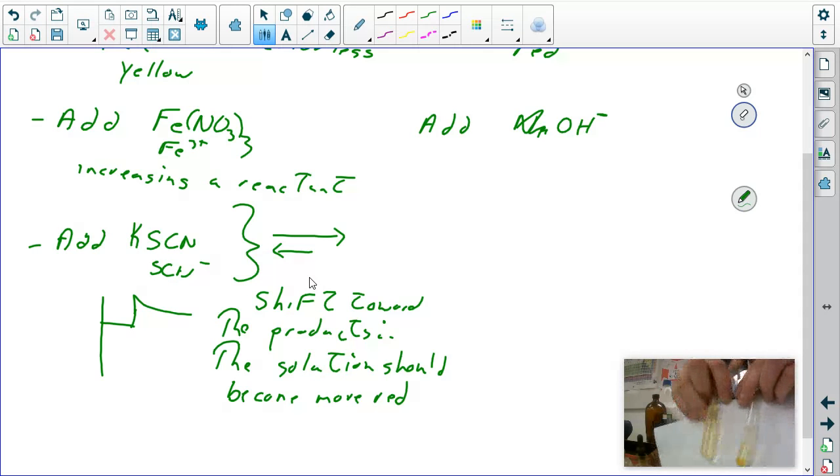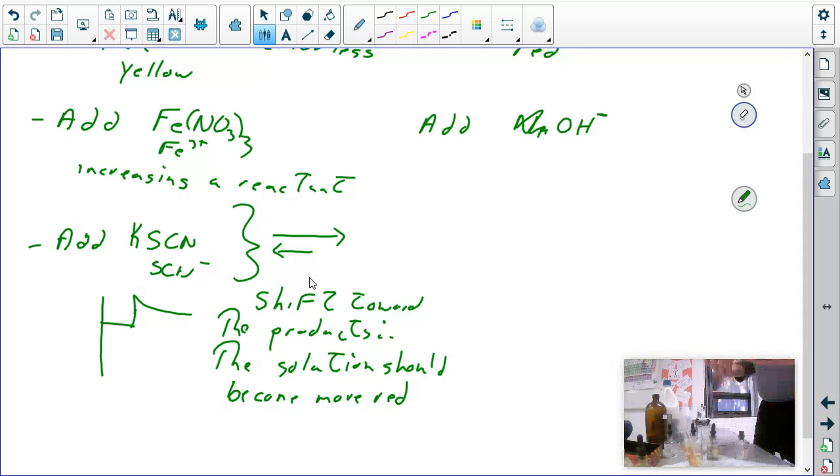The one in my left hand has actually got a little bit more pale than what it should have. And I don't know why. Okay. So, again, bit of a problem. That's experiments. It happens. So, our thiocyanate did not work the same way. Well, something went wrong with the experiment on my end, not our prediction.